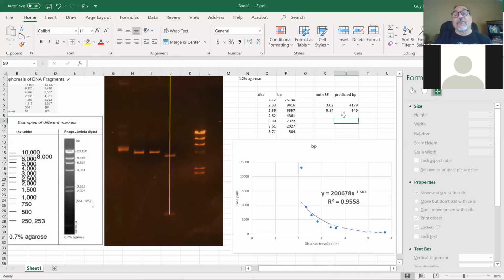So those are predicted, and they're a little bit off, because remember, I think the entire plasmid was 4,400. So if you look here, we're rolling around 4,800, but this is not quite as accurate as one might appear. There are a lot of variables that go along, but we're pretty close.